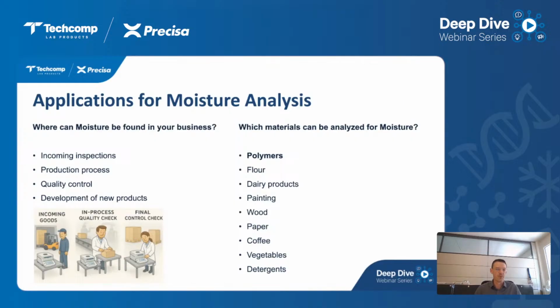Also, it plays an important role in the development of new products, if several iterations are needed to determine the perfect moisture content for your product. Now, the materials which can be analyzed are quite a variety.